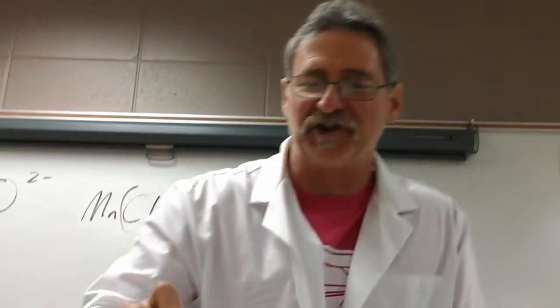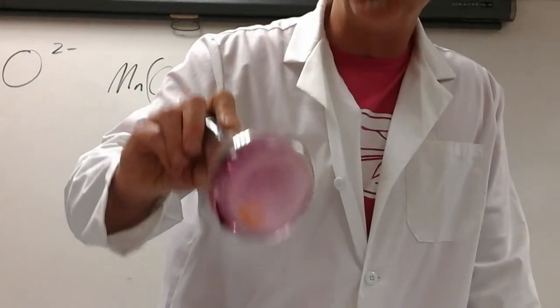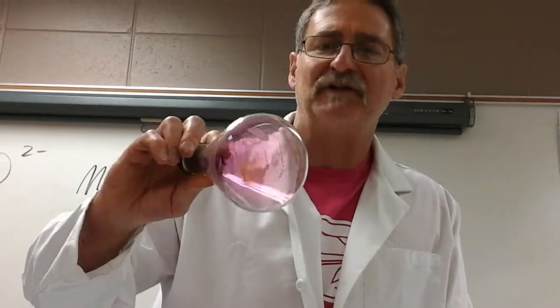Is this a chemical or a physical change? Physical. Very good. A lot of times people just assume a phase change must be a chemical change. Well, it's going from a solid to a gas. But are we seeing any new properties? Are we seeing any color change? It went from a purple solid to a purple gas. No, sirree, Bob. You're not seeing any color change.